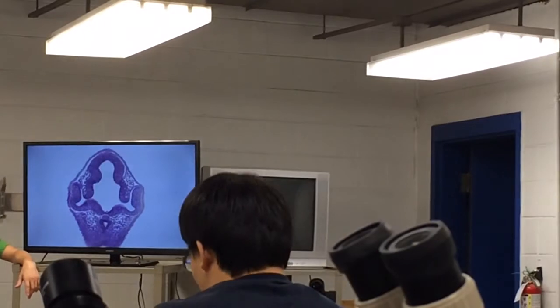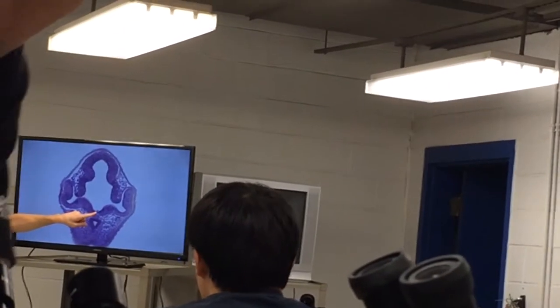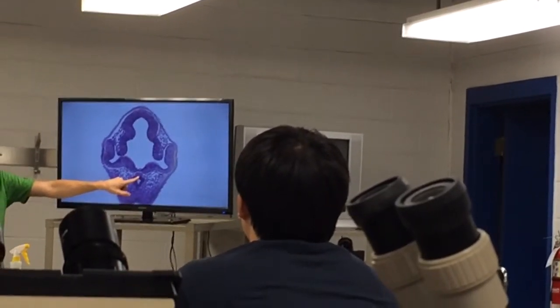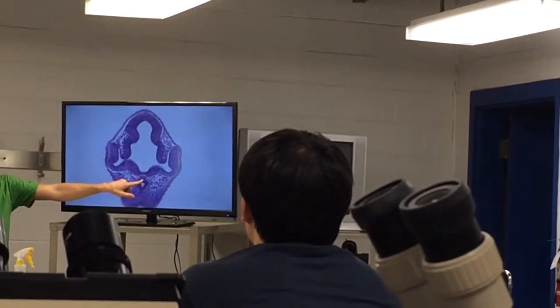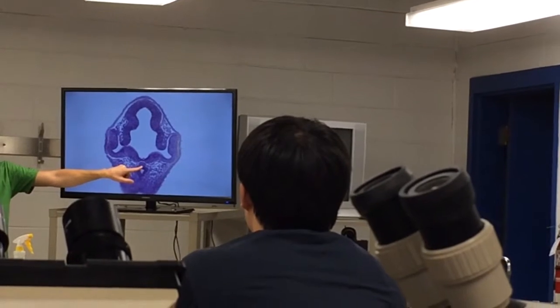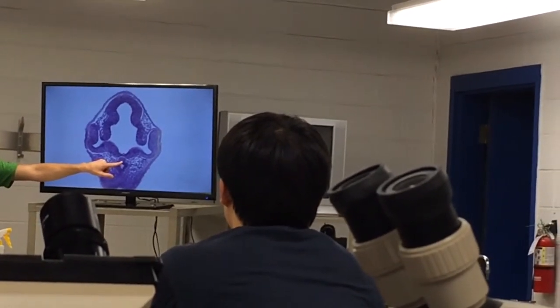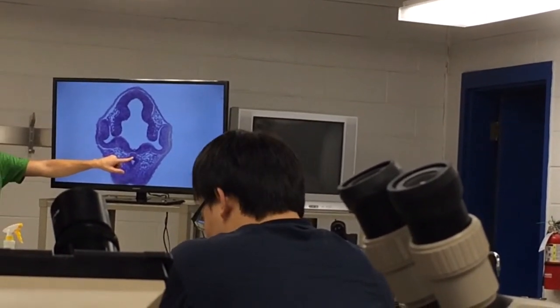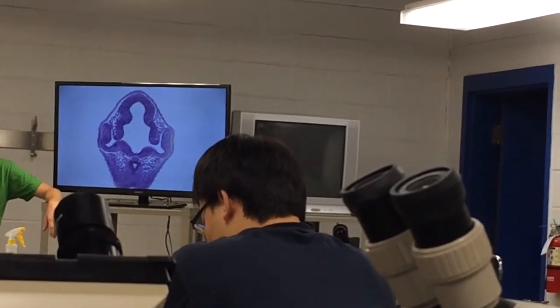Infundibulum is the correct answer. Infundibulum will touch infundibulum. Immediately ventral to the infundibulum, there's an epidermal-ectodermal structure. He's putting his finger on it. What's it called? Adenohypophysis, which makes, in the adult, the anterior pituitary.